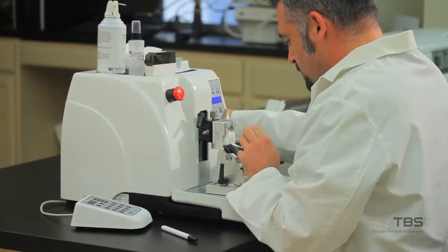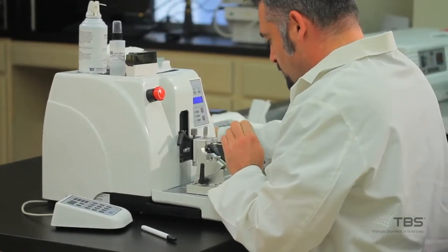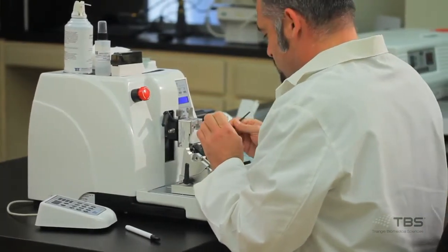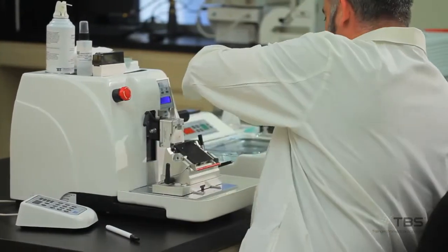SureCut Microtomes are offered in three separate models: the SC2500, 3500, and 4500.